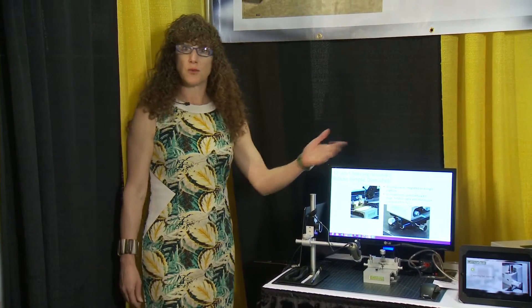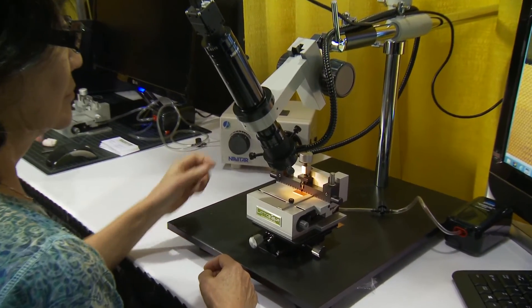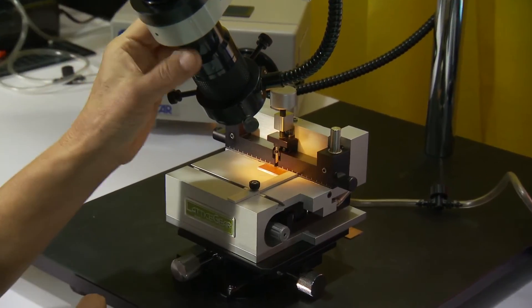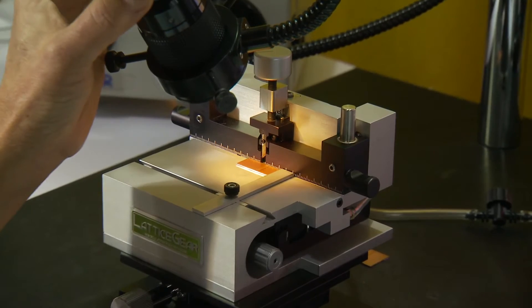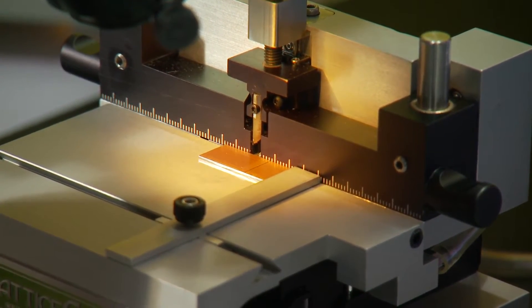Janet is going to demonstrate to us now a full process on the LatticeX 300. Here we have a sample laid on the stage. The sample is held with vacuum.